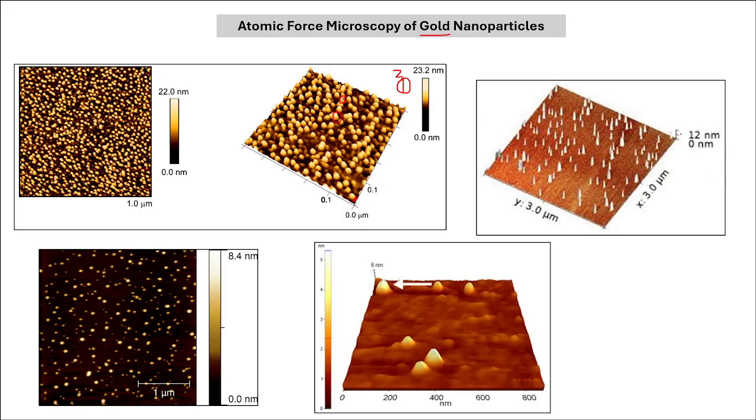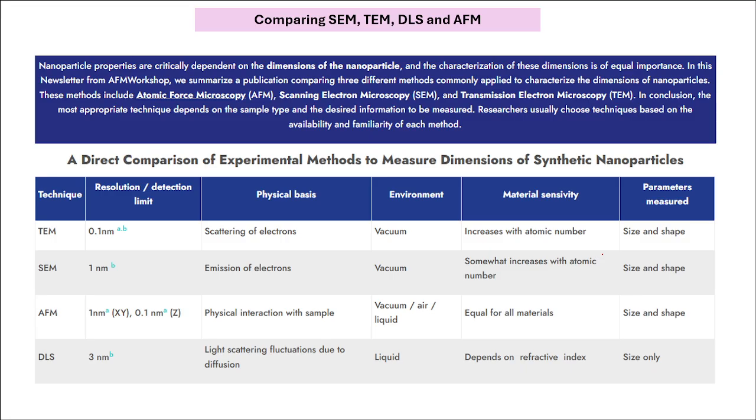Now this is also one of the AFM data. You can find all these kinds of data in the literature for gold nanoparticles and for other nanoparticles as well. This one denotes a height somewhere around 6 nanometers, and then this one can also be estimated based on different x and z axes. This one is for 8.4 nanometers. So this is how sample representation is done. This is what kind of data is generated by the instrument.